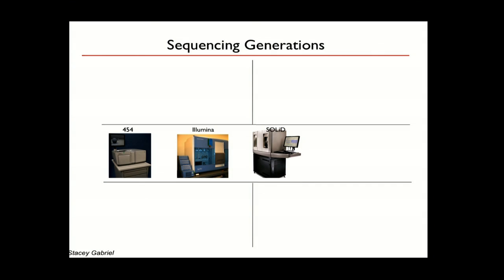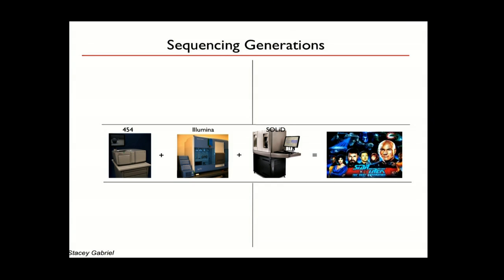So I'll go very quickly through this introduction. This stuff will be available on the web for everyone who wants to look in detail at this. Basically, this is what people call next-gen sequencing. There's 454, there's Illumina, there's Solid. There are 3 machines of approximately equivalent quality. 454 is a little more expensive these days, but these are the 3 major players in next-gen sequencing.